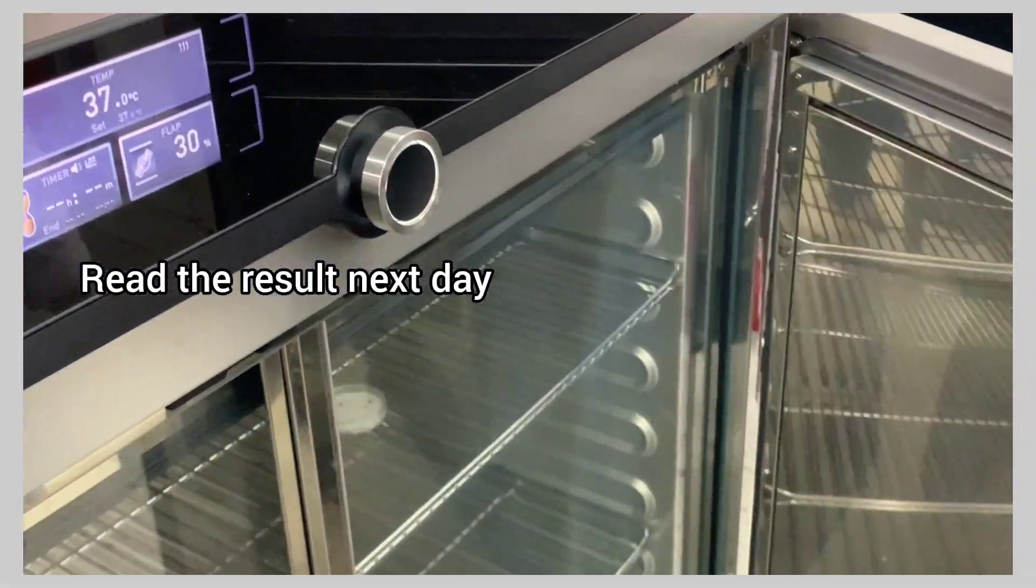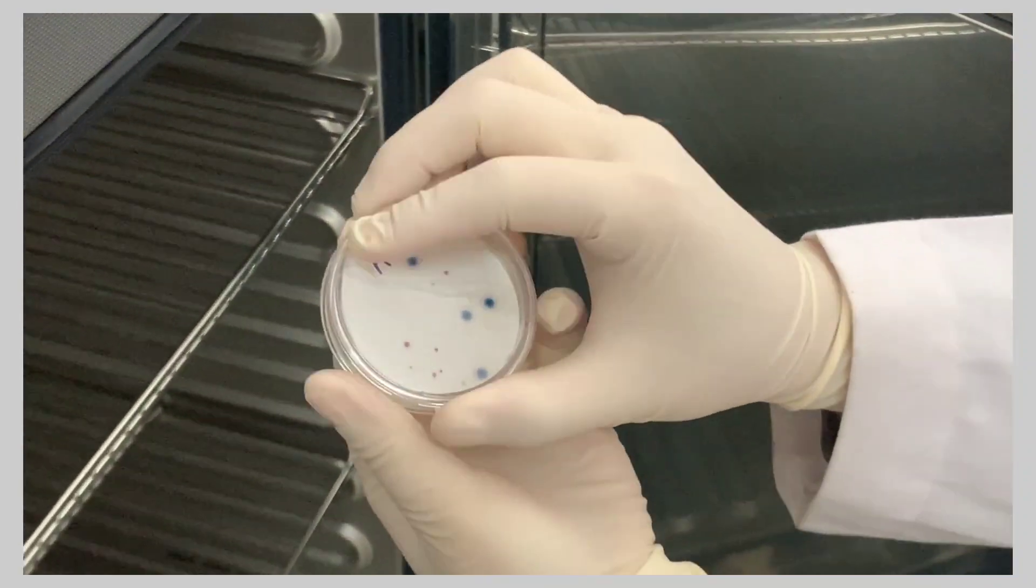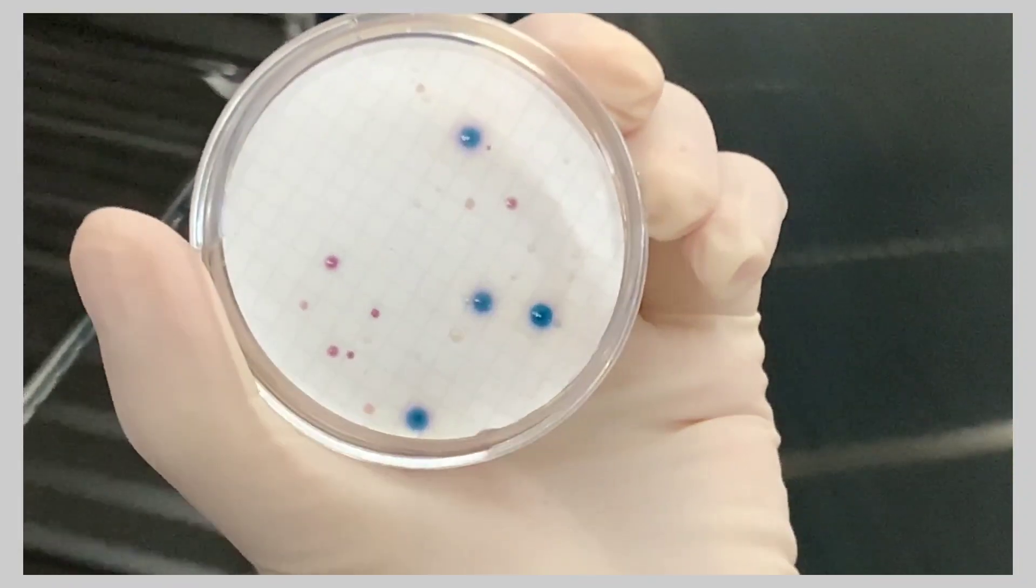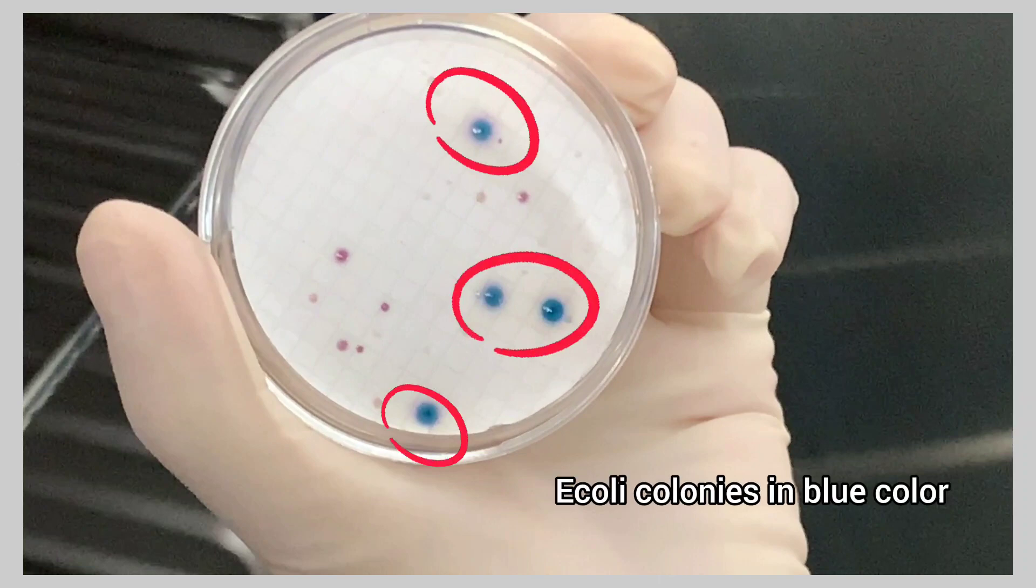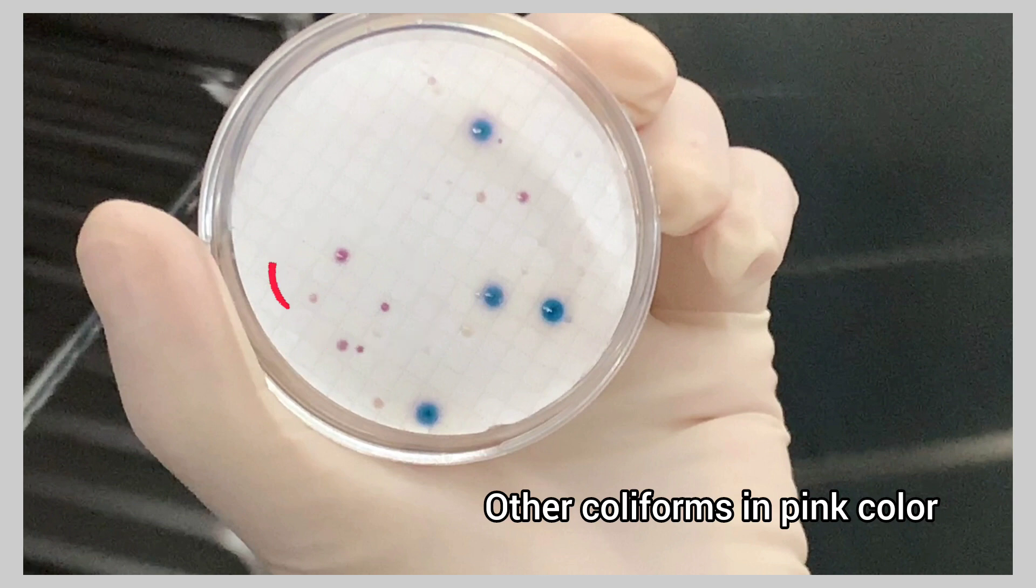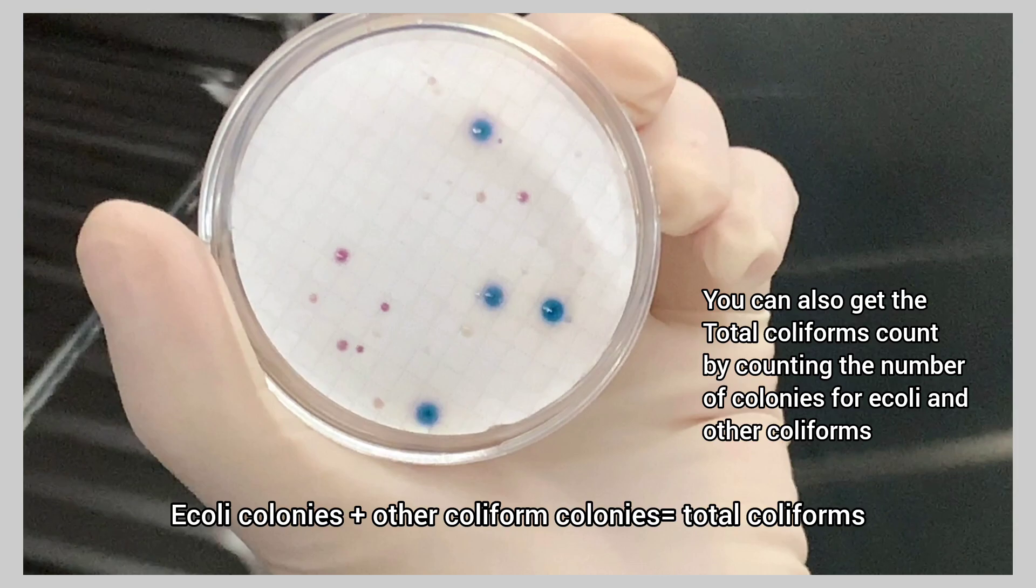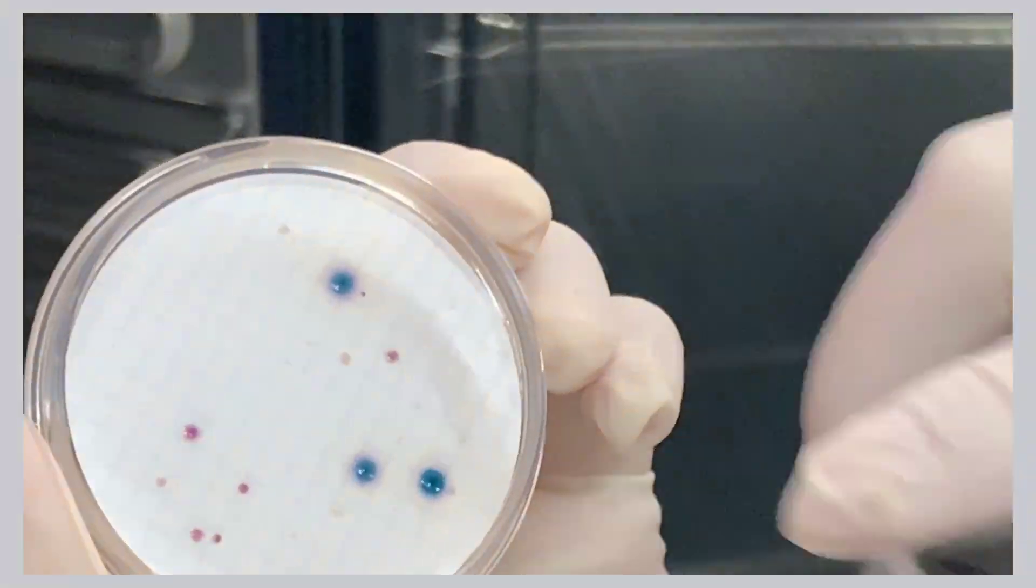Read the result next day. E.coli colonies are in blue color and other coliforms are in pink color. You can also get the total coliforms count by counting the number of colonies for E.coli and other coliforms.